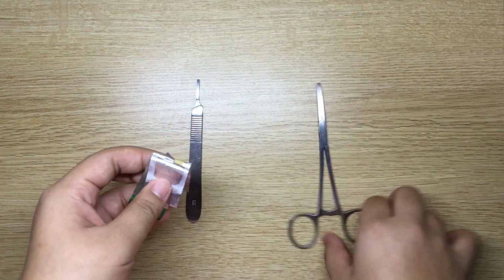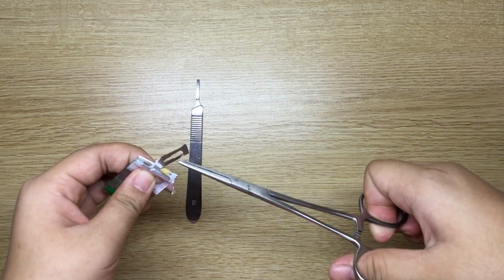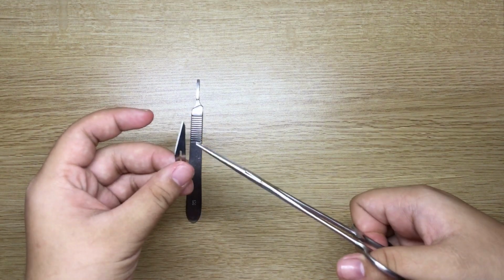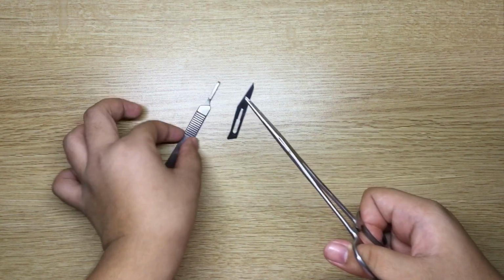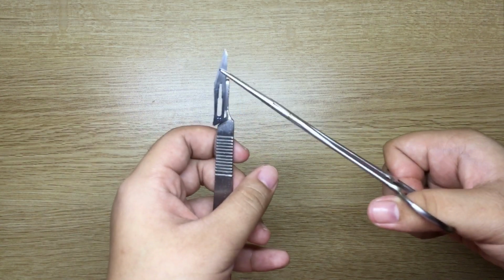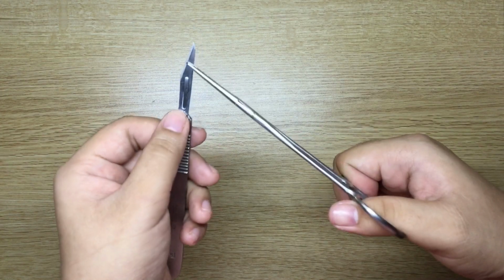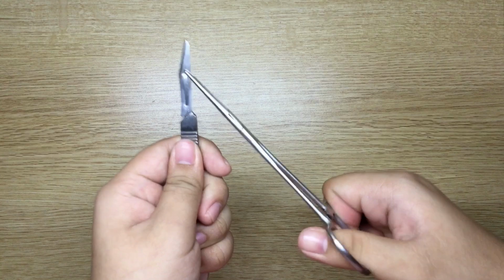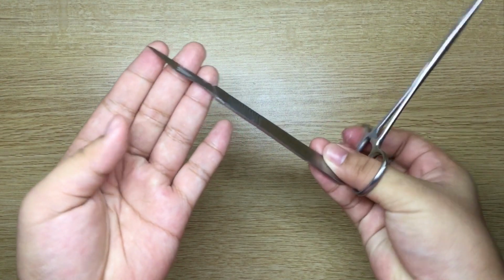To install your blade, start by opening the package and insert it into the blade holder. Using your hemostatic forceps, get a secured grip on the blade and click it down 3 times. Grab your scalpel handle and you will notice that the handle and blade have an angle. Once you have the right way, slide the blade into the slot. Then once it's on your track, slide all the way till it clicks. There you have it.